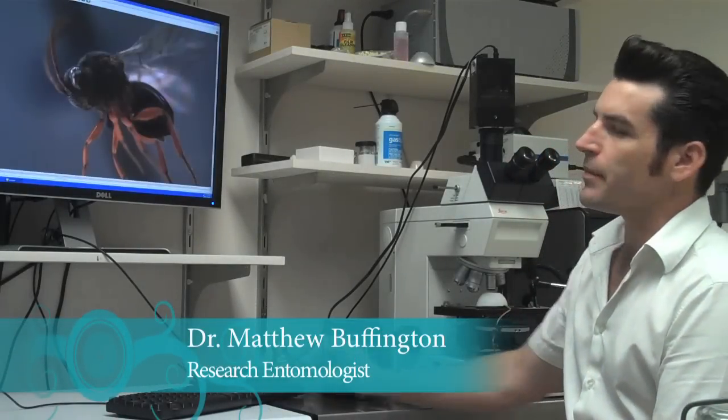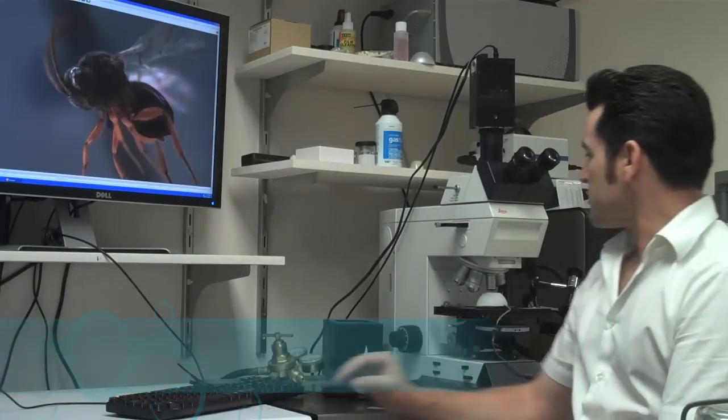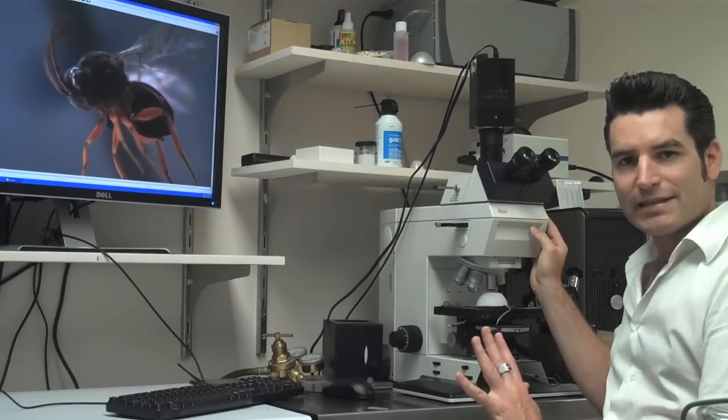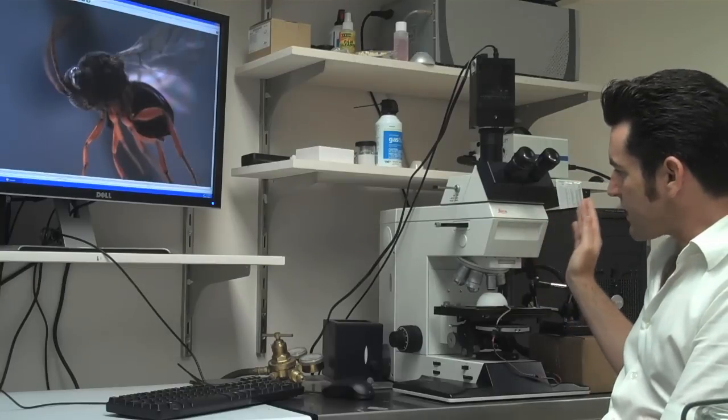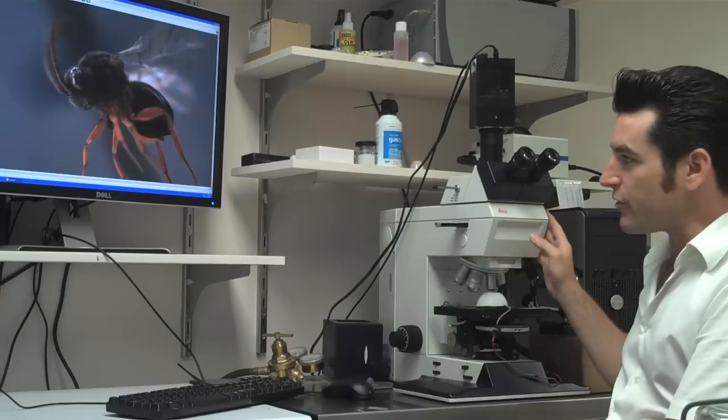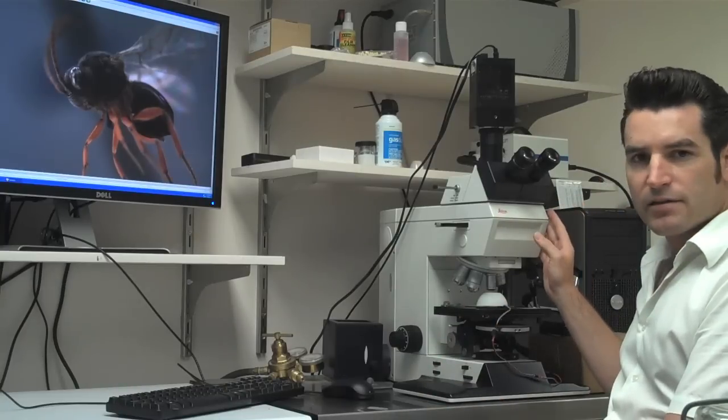The limitations of the former imaging system were overcome by the use of a compound microscope for imaging whole insect specimens. This technology is engineered specifically for examining slide-mounted specimens.